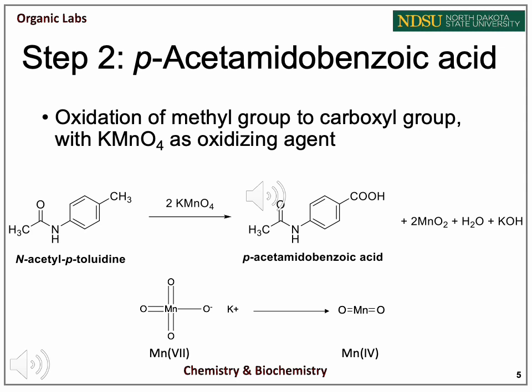In this reaction, potassium permanganate changes to manganese dioxide, and in turn goes from manganese 7 to manganese 4. Remember, something that oxidizes has to be reduced in return. There will always be a give and take.